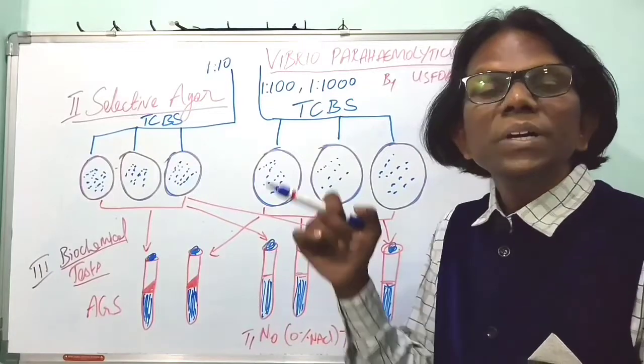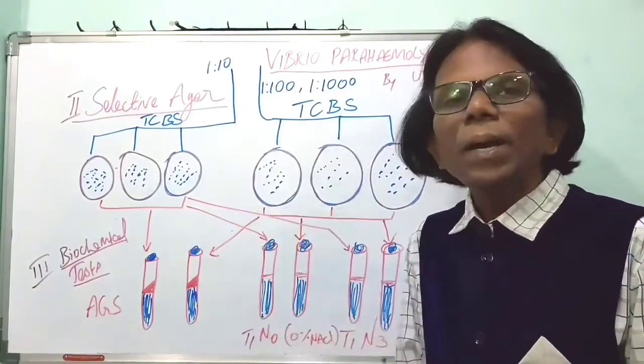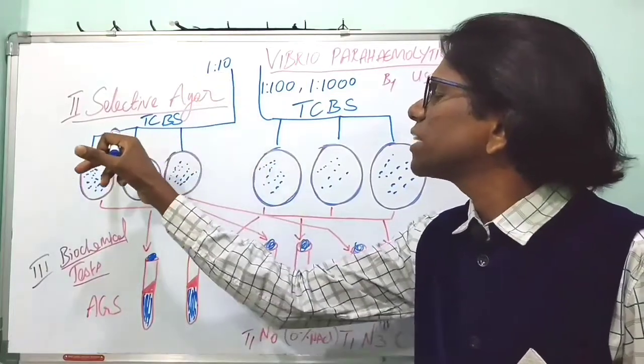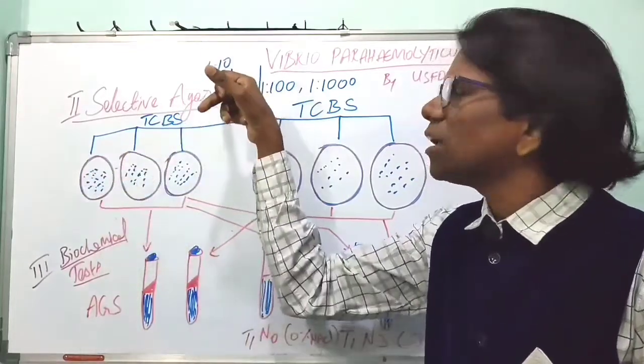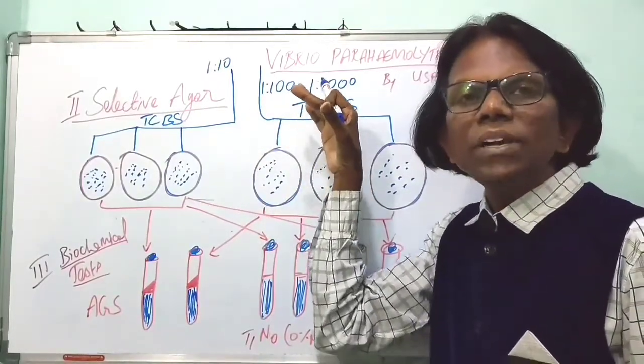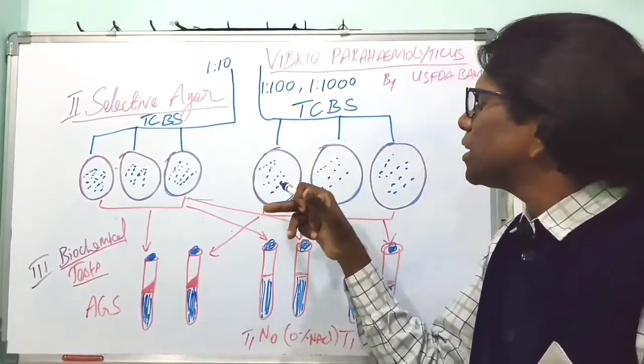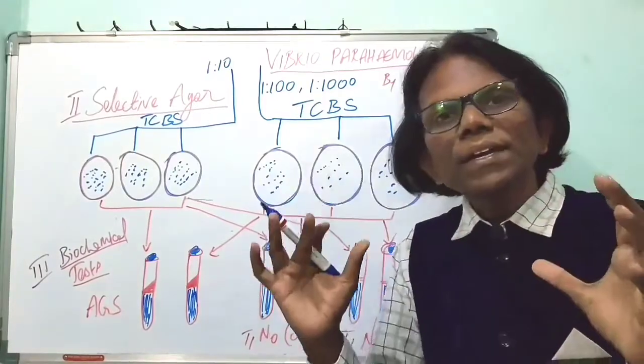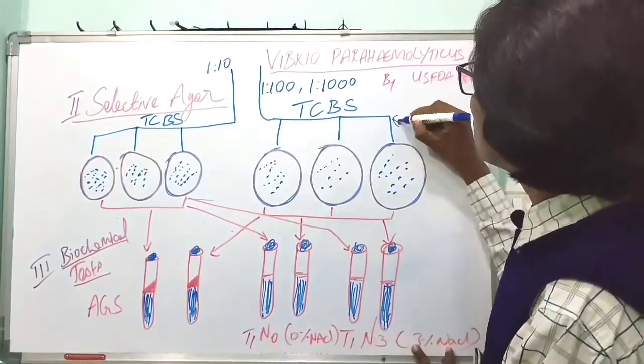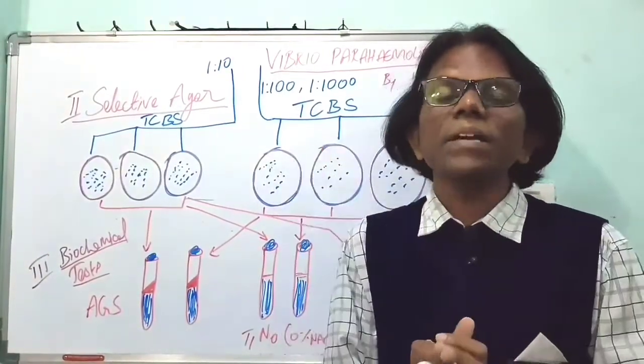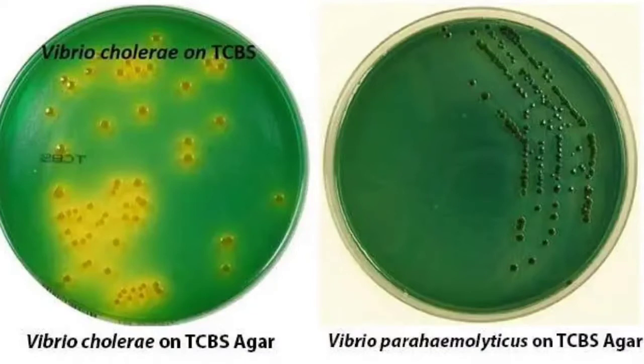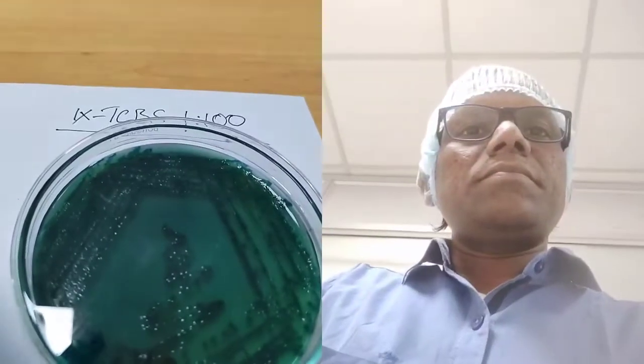Once the TCBS plates are dried, transfer 3 mm loop full of primary enrichment inoculum. Take inoculum from 1 to 10 dilution and streak onto the TCBS plates. Then again, take 1 to 100 dilution and 1 to 1000 dilution of inoculum from primary enrichment medium and transfer to TCBS plates. Incubate at 35 plus or minus 2°C for 18 to 24 hours. After 18 to 24 hours, Vibrio parahaemolyticus will exhibit colonies. The colonies will appear blue or green color with 2 to 3 mm diameter with opaque centers.